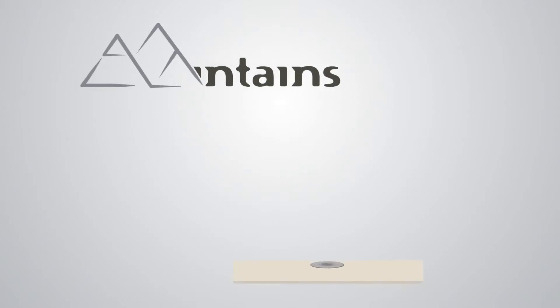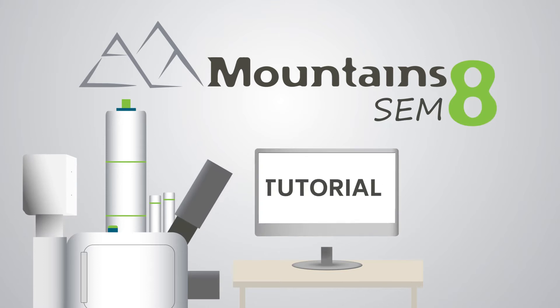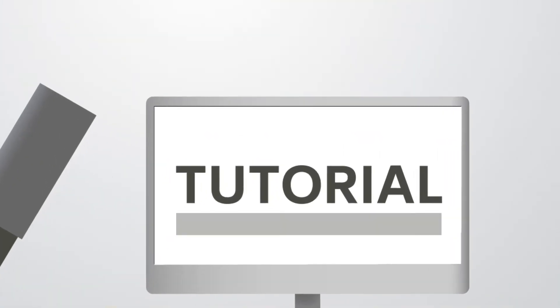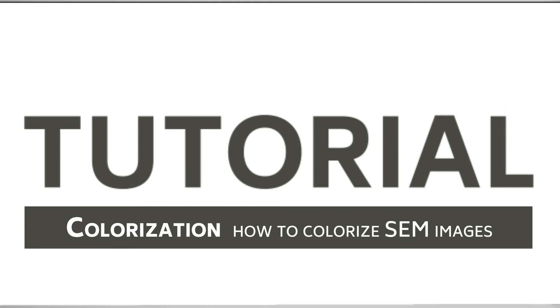Hello and welcome to this video tutorial on Mountains SEM, DigitalSurf's industry standard software for scanning electron microscope image analysis. Today I'm going to show you how you can colorize your SEM images with Mountains.